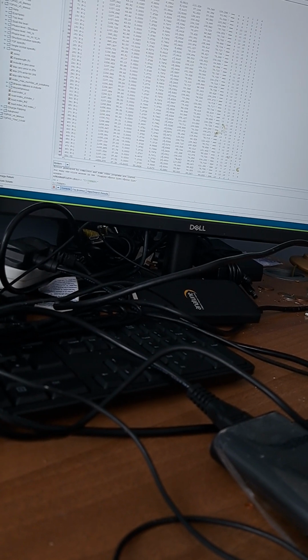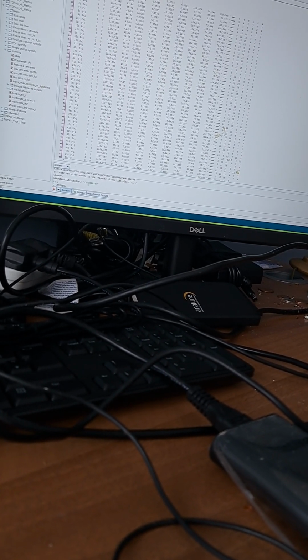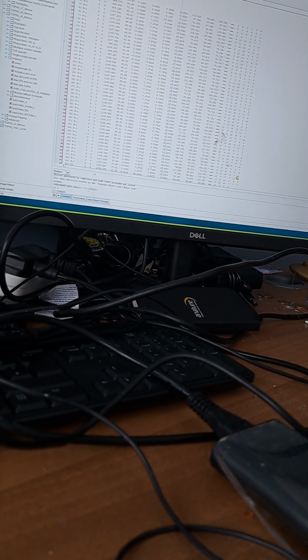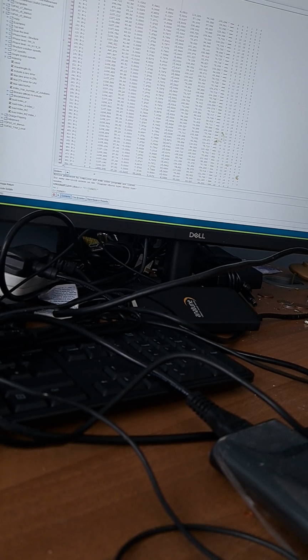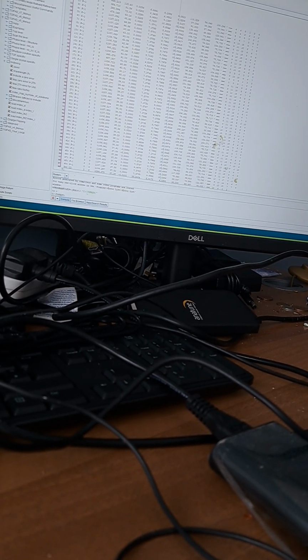So what is the purpose of this, Sadia? I understand that you want to learn how to do indexing, but we've got a potential indexing already that looked pretty good. And I'm wondering, are we not looking to try and solve the structure?